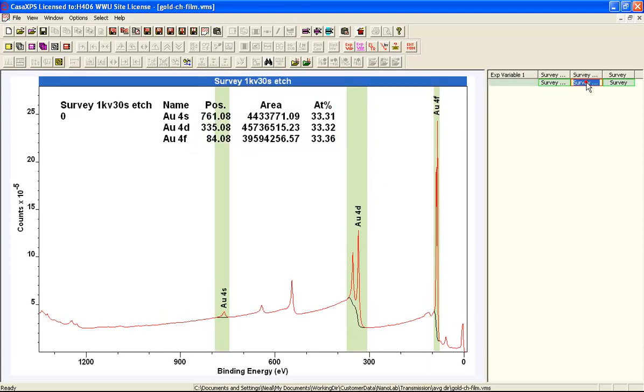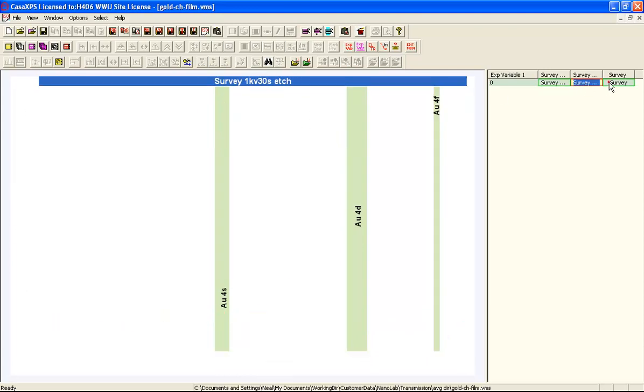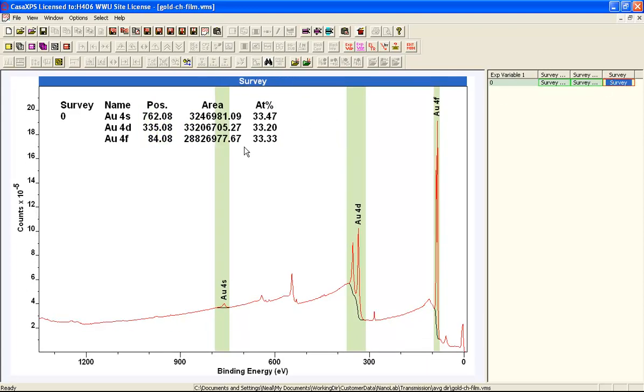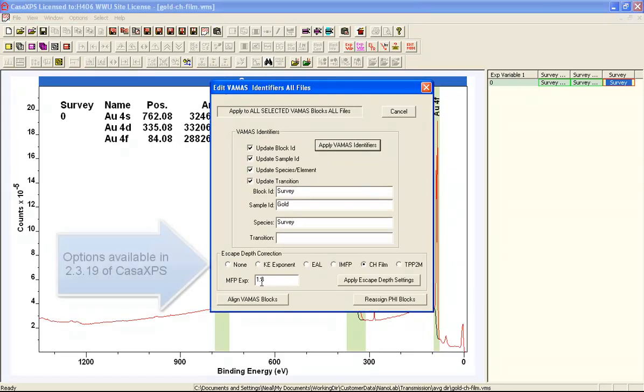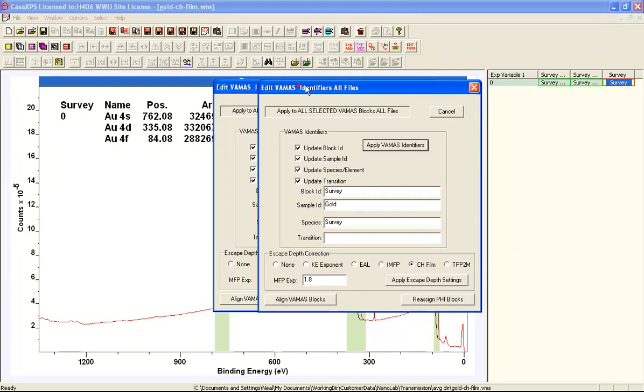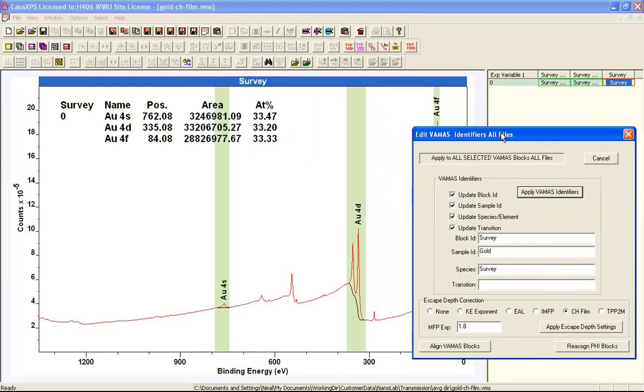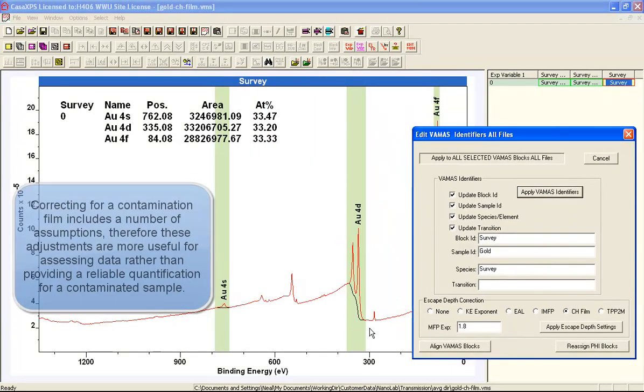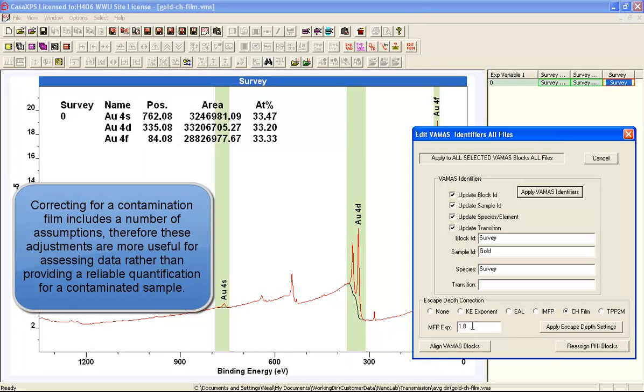So the peak areas have been now adjusted for the overlay of a hydrocarbon film. Now the value that I entered is 1.8 and this would be relative to a pure hydrocarbon something like PP hex.